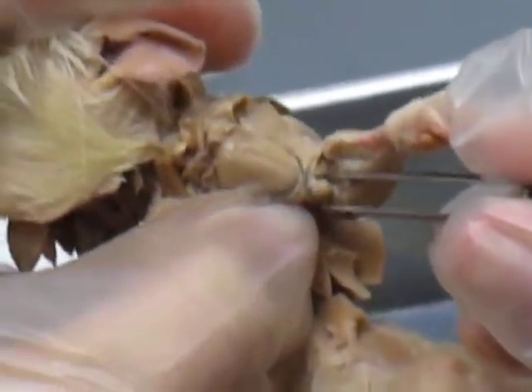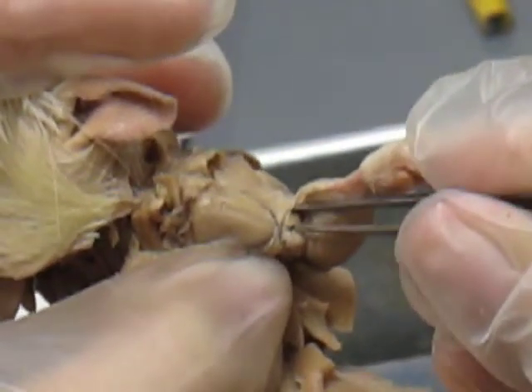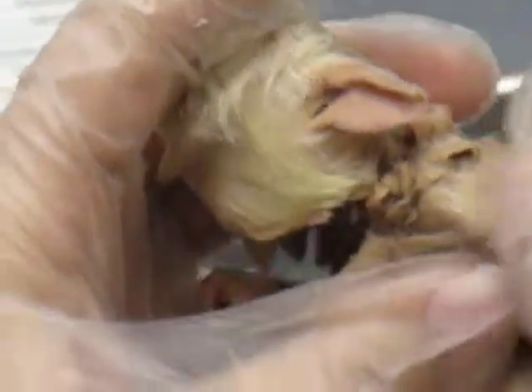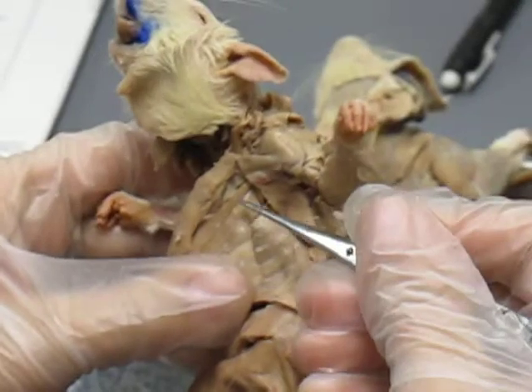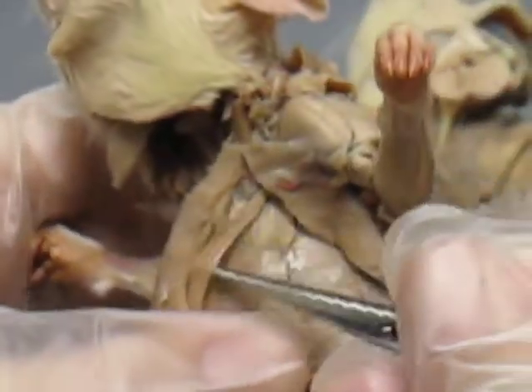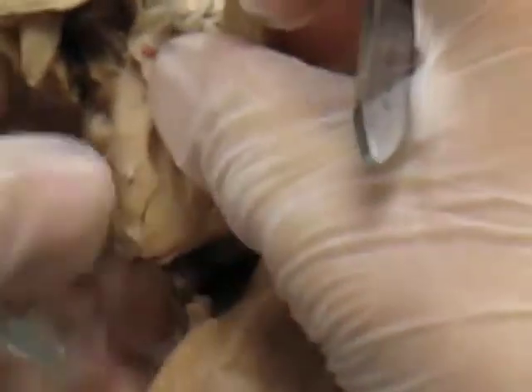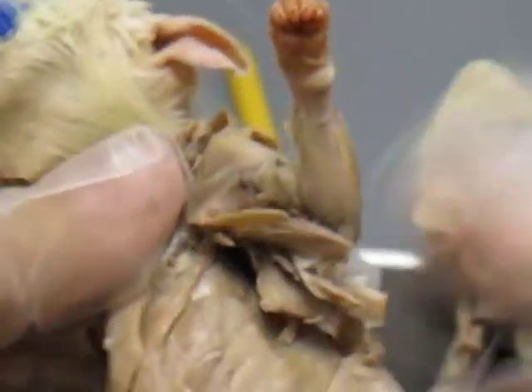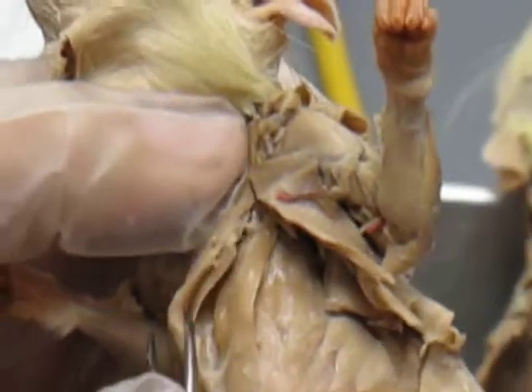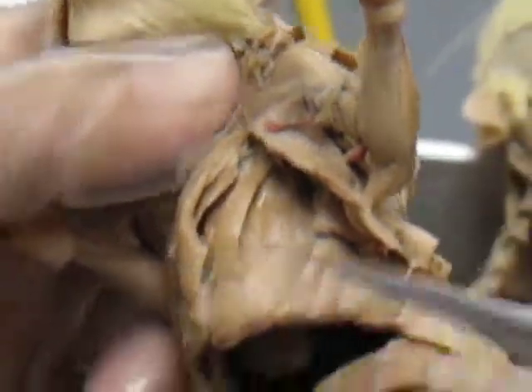Biceps brachii shorthead and brachialis. And there's a nicer rectus thoracis — showing how you should cut and reflect that way. You just can't see the rectus abdominis quite as nicely. That's rectus thoracis.